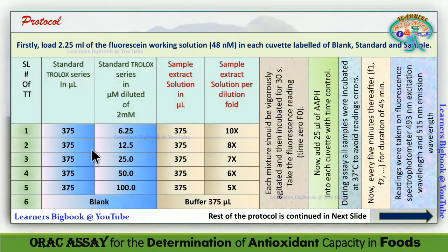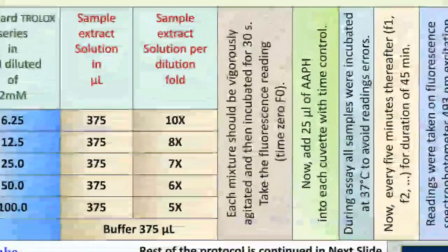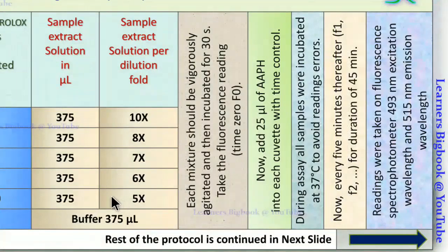Further, after adding all the chemicals into their respective containers, each mixture should be vigorously agitated.